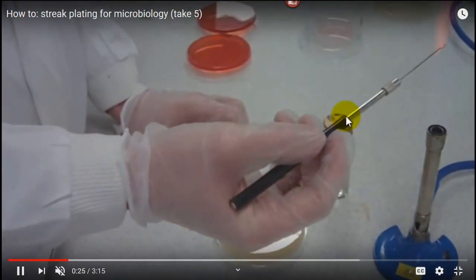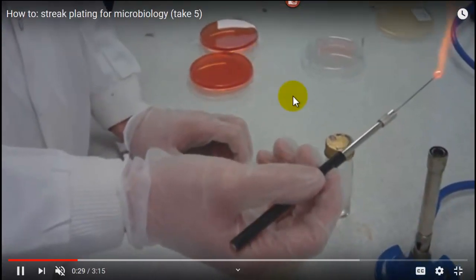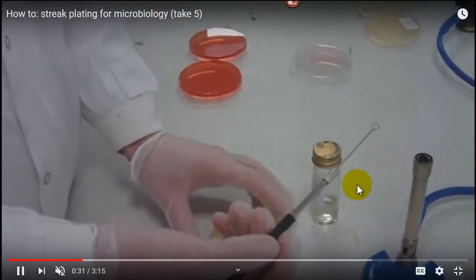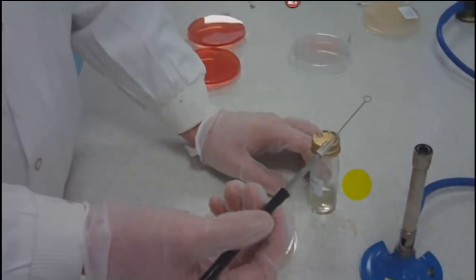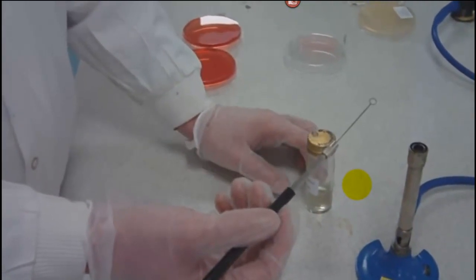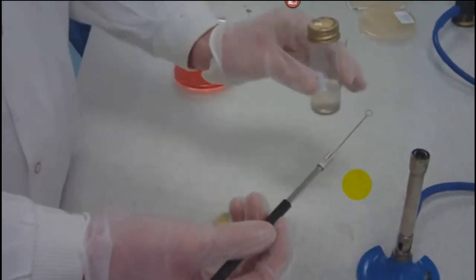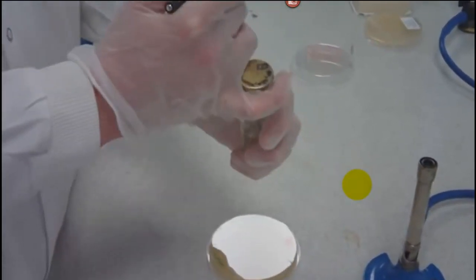So some bacteria growing. It looks like water, and then I actually see some diagnostic media in the background here. So this person has sterilized their loop. They are now, looks like they're going to open up this vial. He's going through some detailed explanation, but it's the whole aseptic technique.